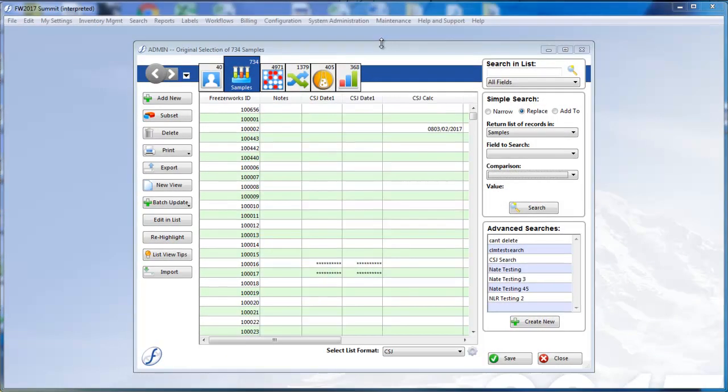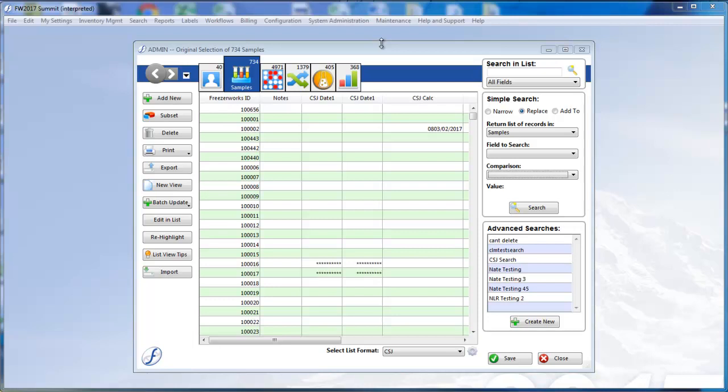Hello, and welcome to part 1 of our look at the updated TESI module in FreezerWorks 2017. Since the TESI module is now fully integrated with the Summit Edition, we thought it best to run through its processes once more. Today, we'll quickly go over what you can expect from the program now that tests are a part of it.